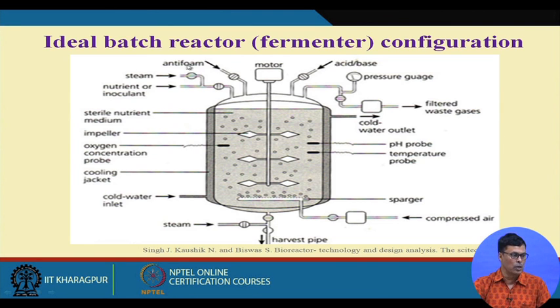So we use antifoam oil. We put a sensor here. As soon as the foam touches the sensor, it is connected with a pump, which is connected with the antifoam oil tank, and that will drag the antifoam into the fermenter, so that your foam will subside.